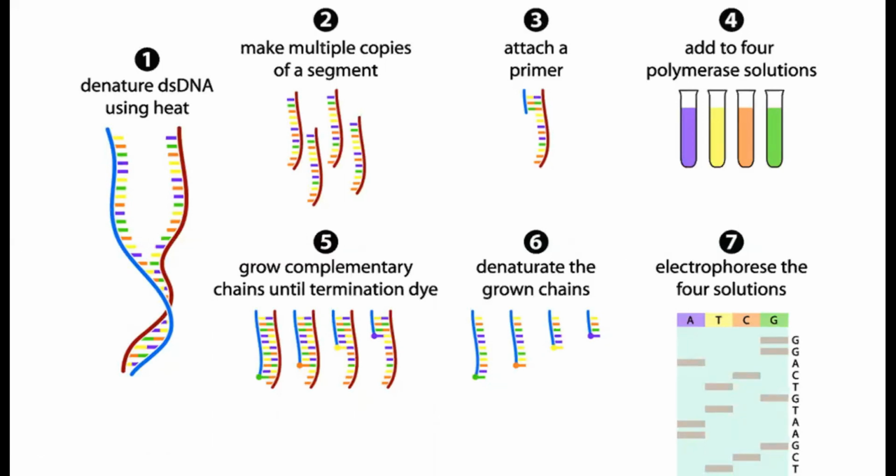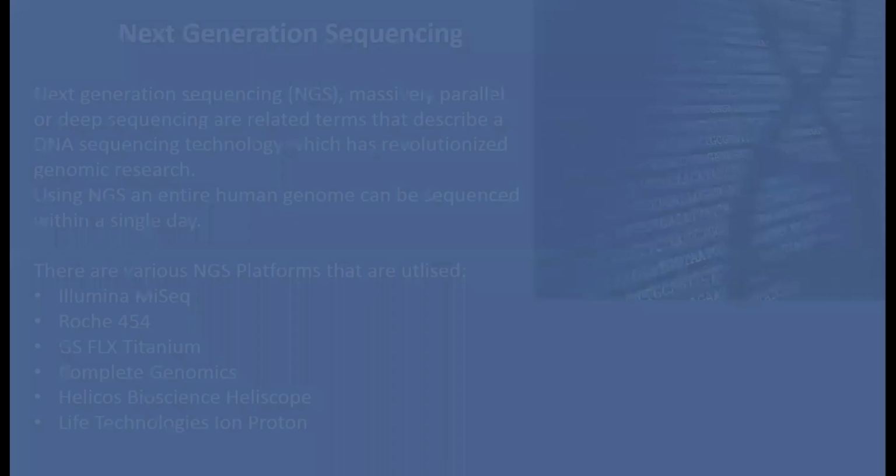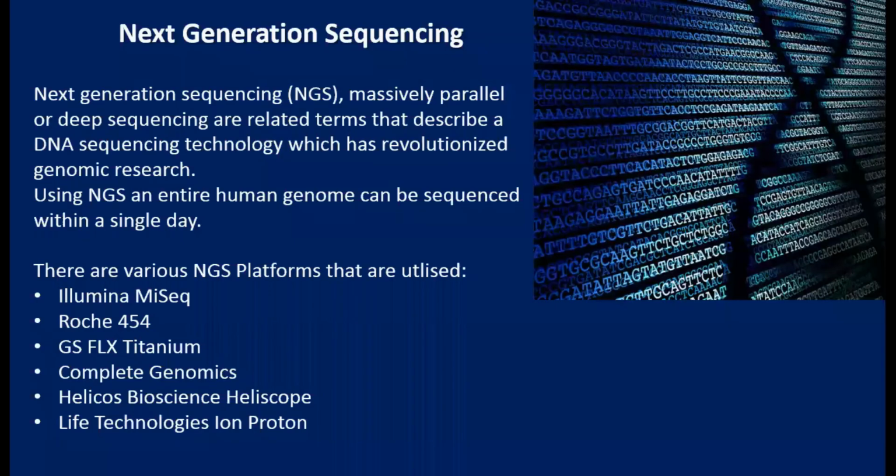So the takeaway from this particular process is that, in addition to the 2' OH, you're also removing your 3' OH group. And that creates a process whereby no incoming nucleotides have the ability to bind to your 3' OH group, and that terminates the chain. That's why it's called the chain termination method. You are basically manually restricting the chain so as to get your desired DNA sequence, right?